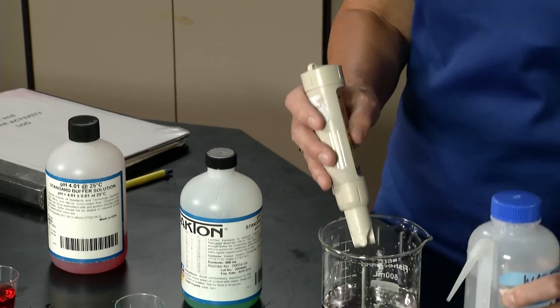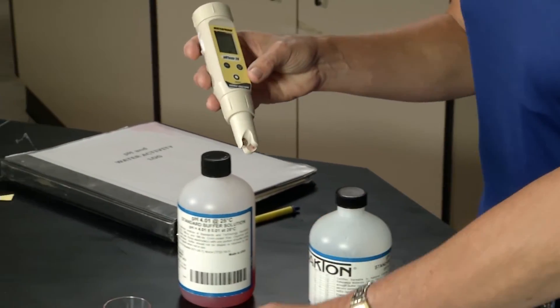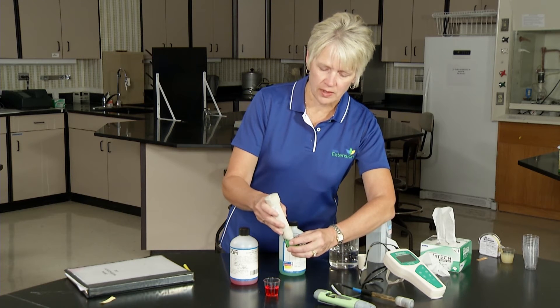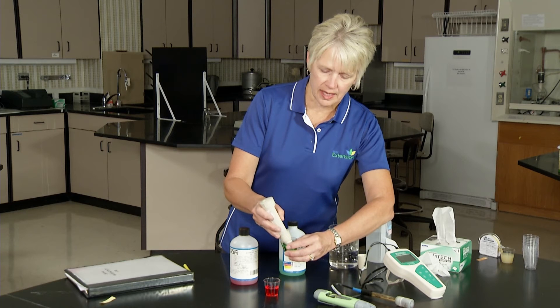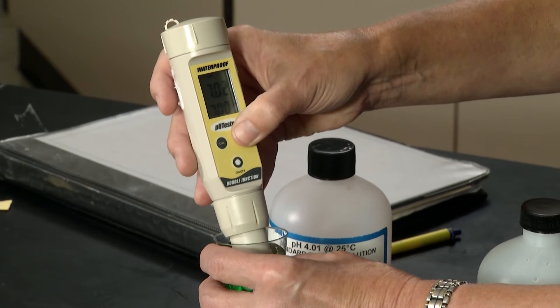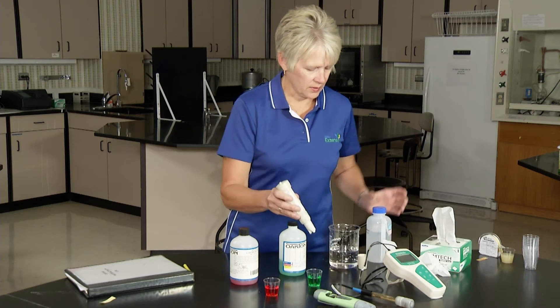Sometimes people want to take that out of the solution then press hold enter. Now for the second part of the calibration, I leave it in calibration mode and once again it will naturally start to find 7.0. Okay, that's pretty close — there we go. I'll rinse it off.